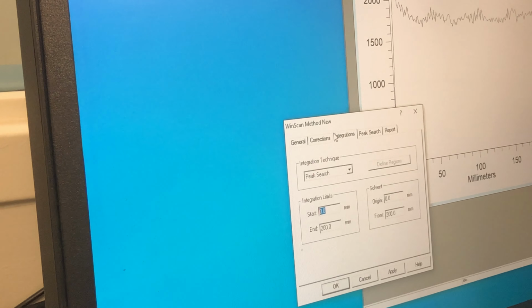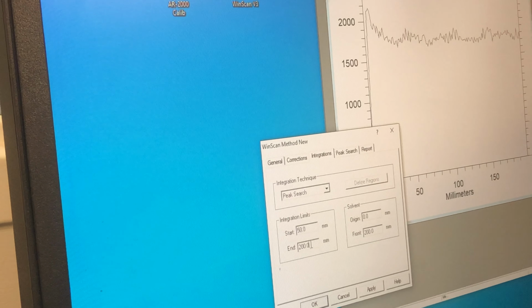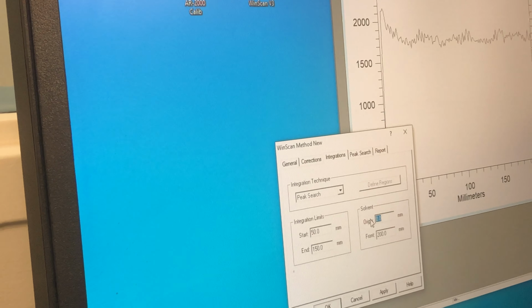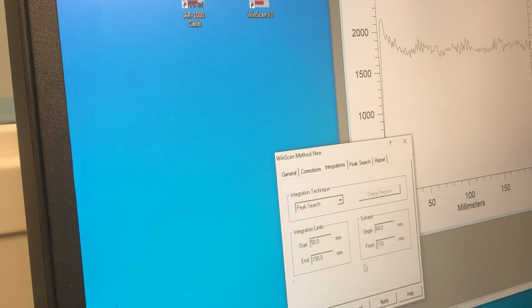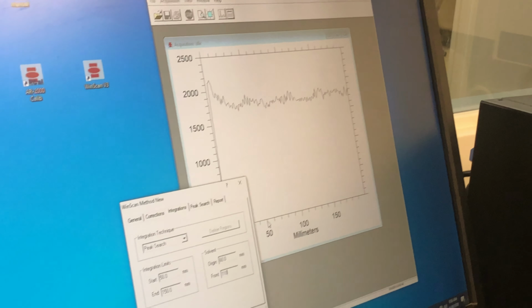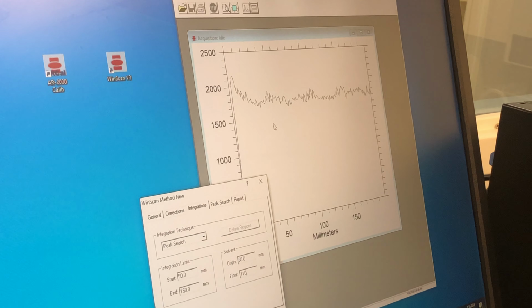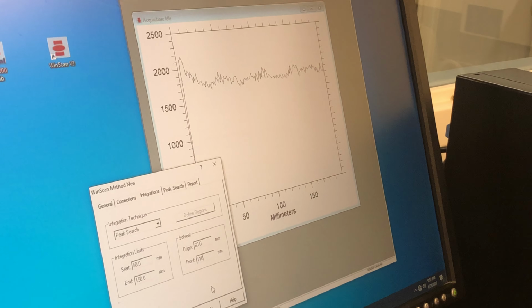We're going to go with, say, the starting point 50 and go to 150 millimeters, typically a 100 millimeter plate. And the origin then would be 60 and 110. I recommend, if you're using 100 millimeter plates, or here we're using 75 millimeter plates, 1 by 3 inch.